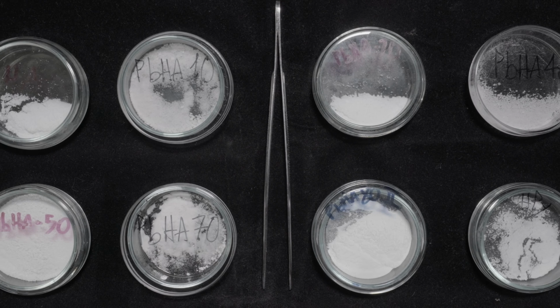These synthesized compounds were characterized and compared with the standard hydroxyapatite, using different techniques. Some were performed here in Perugia, such as infrared spectroscopy, Raman spectroscopy, and X-ray diffraction. I also performed synchrotron analysis at ESRF.